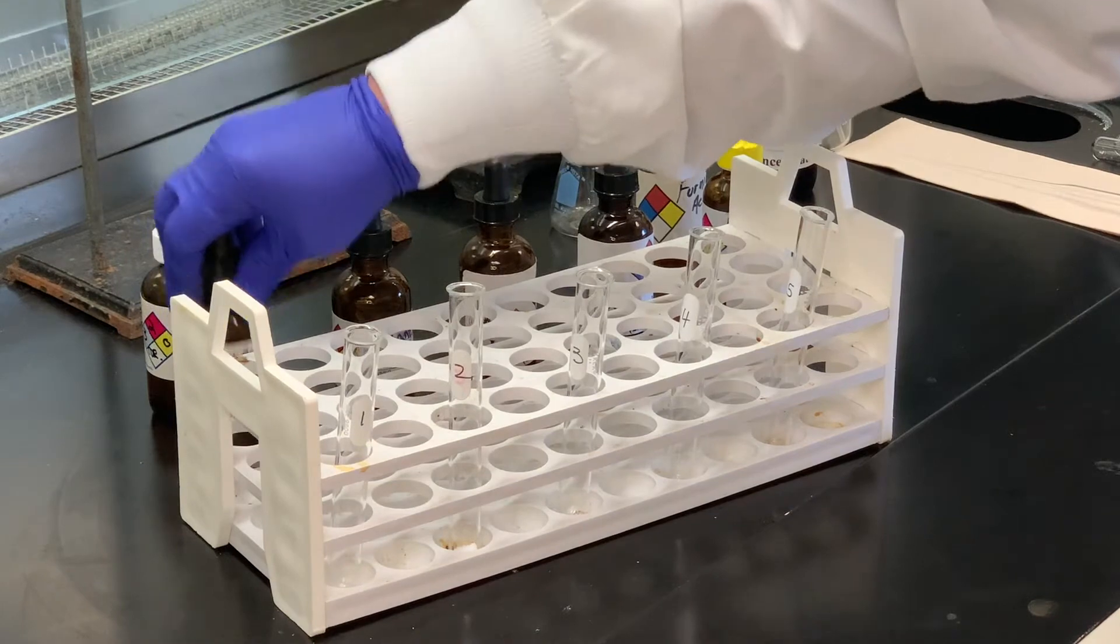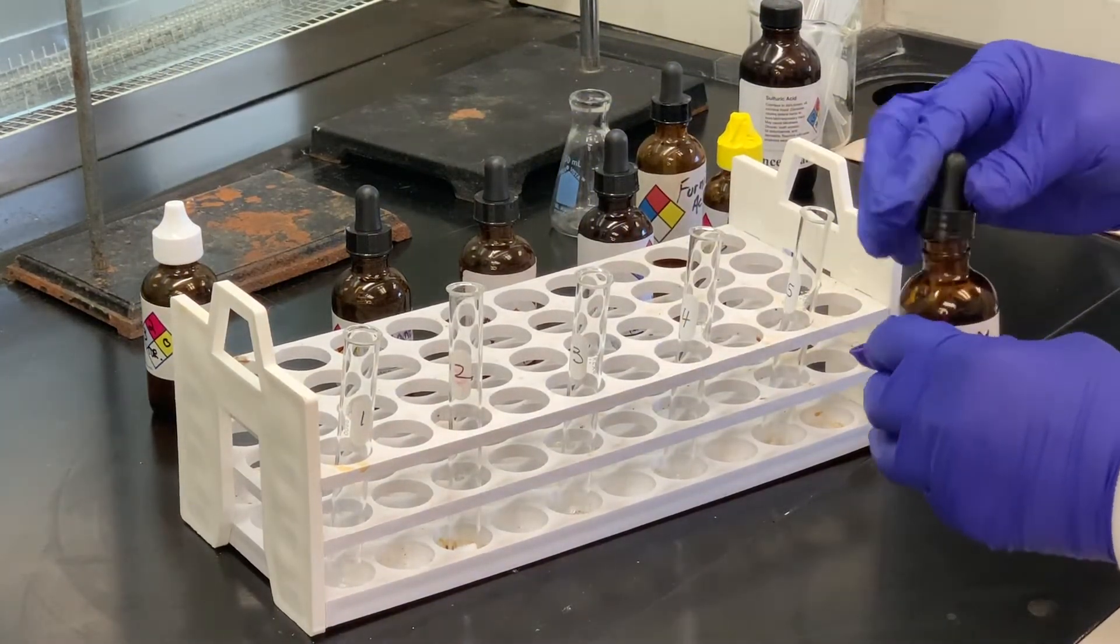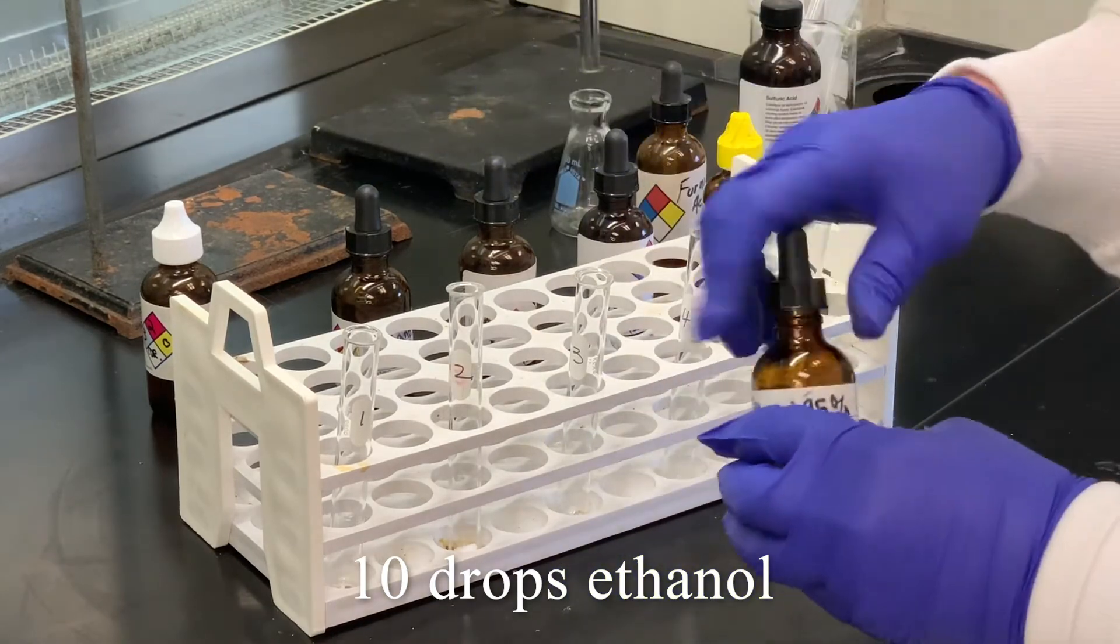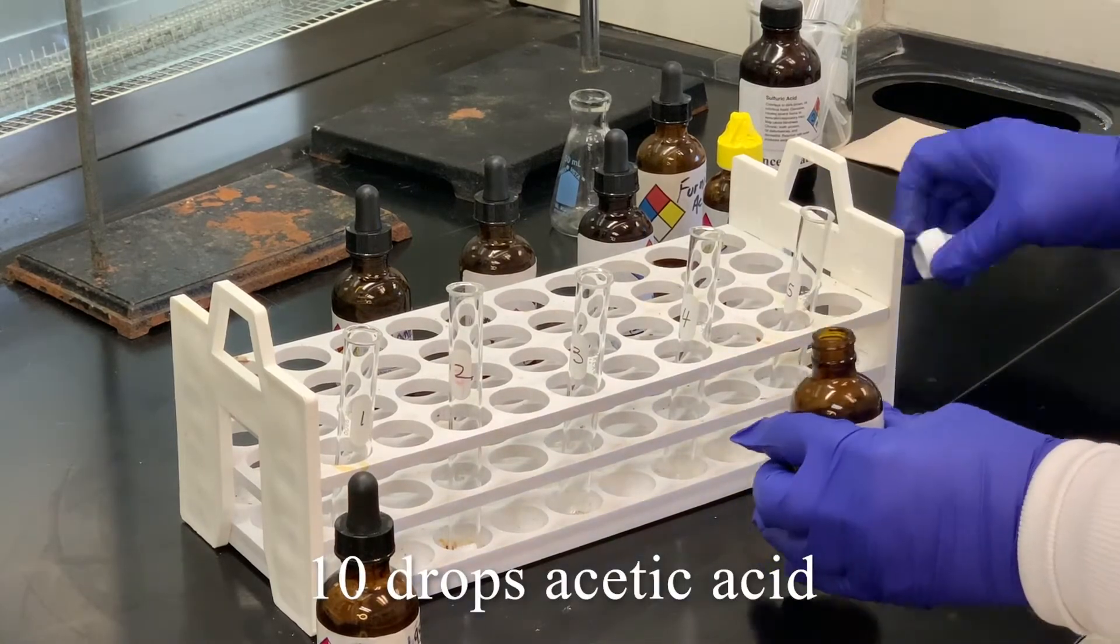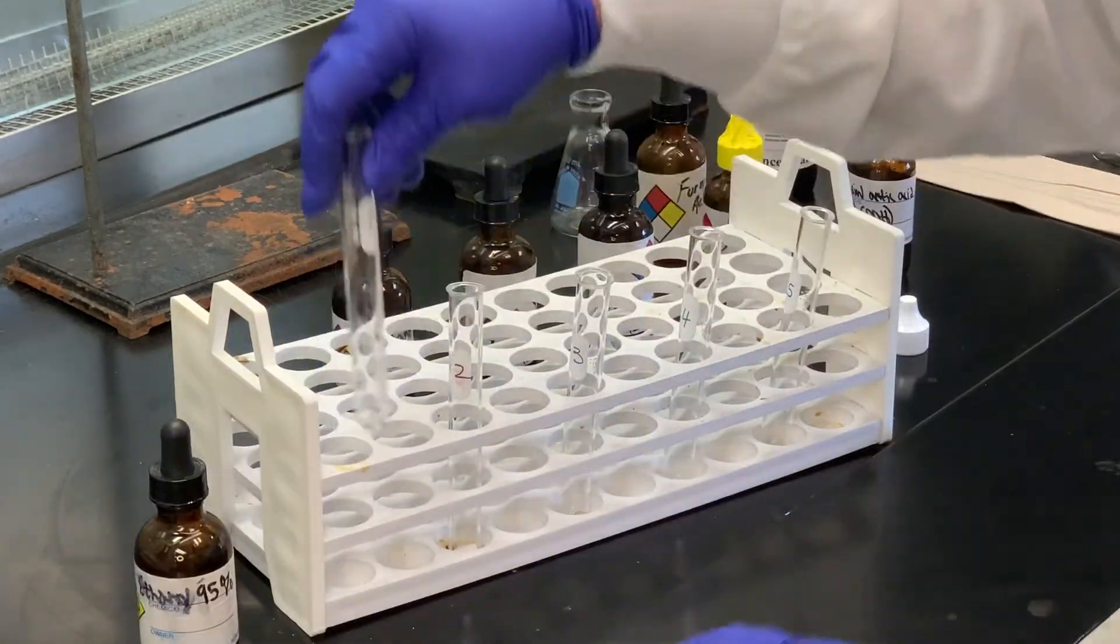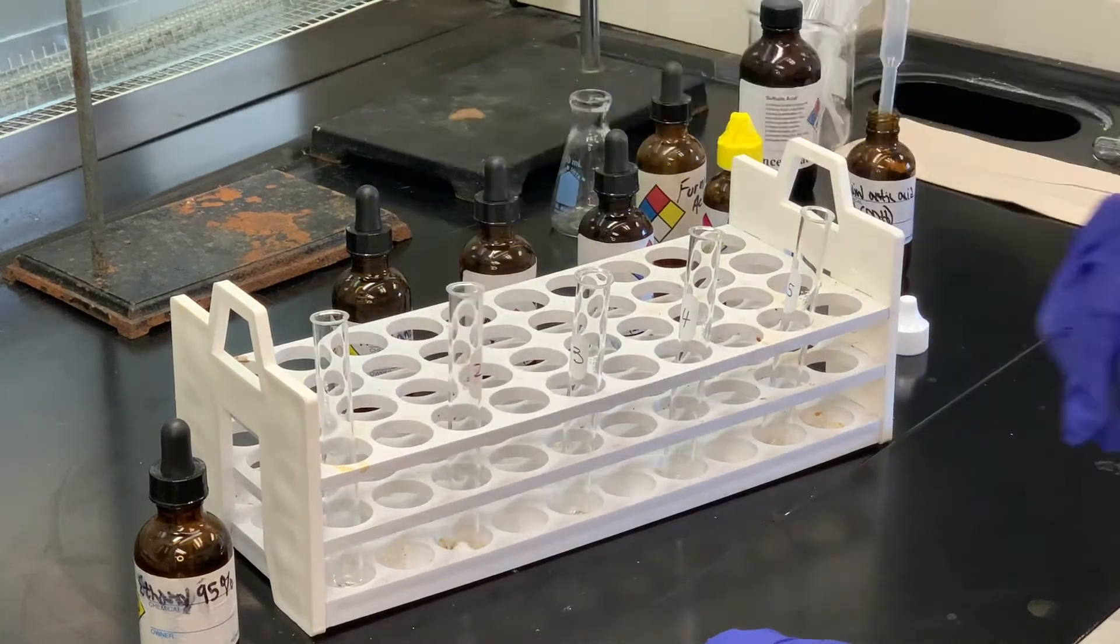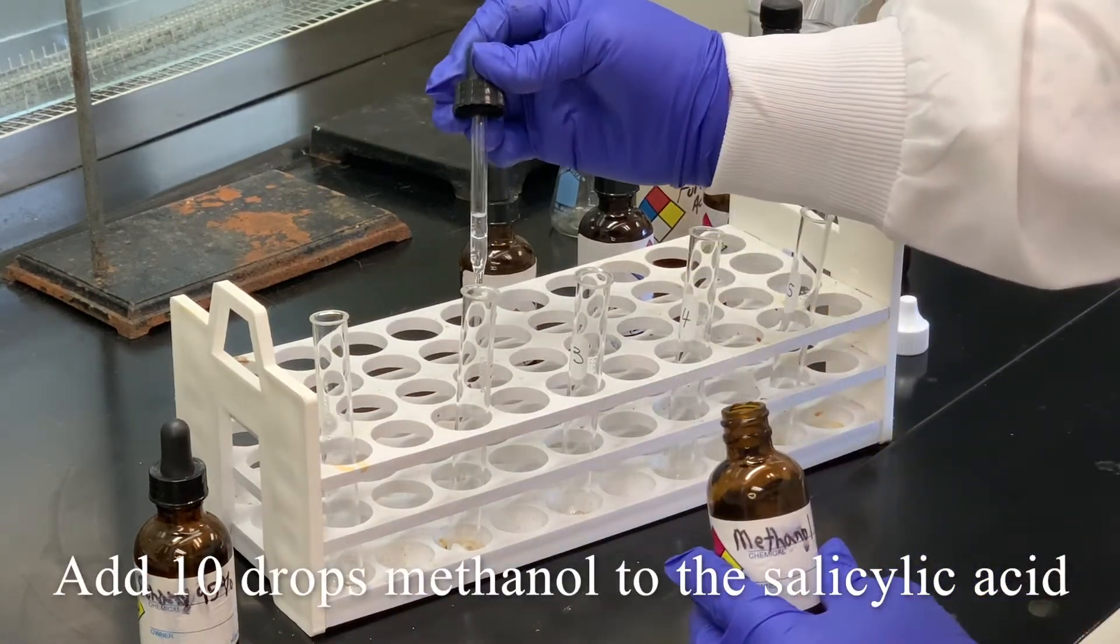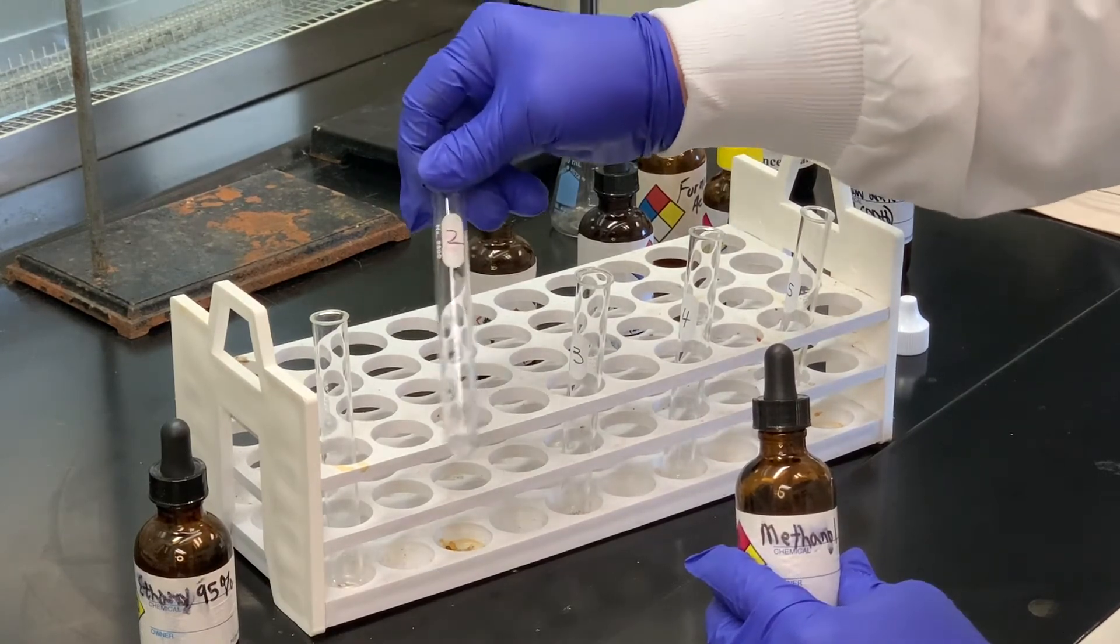In the first test tube, we're going to put ethanol and we're going to use 10 drops of the ethanol. And to that, we're going to add 10 drops of the acetic acid. We'll swirl that to mix. In the second test tube, we've got the salicylic acid. And to that, we're going to add 10 drops of the methanol. And you can tell that solid has dissolved.